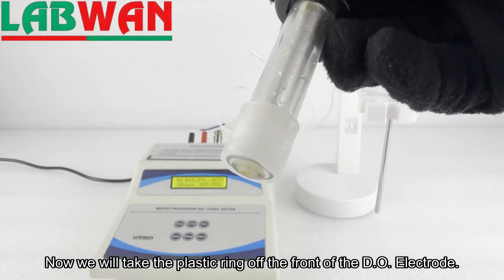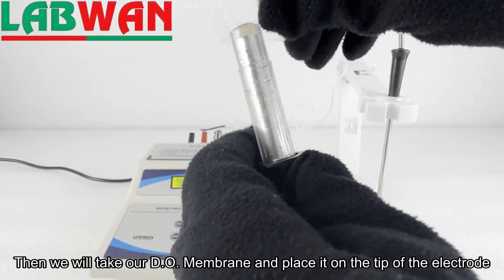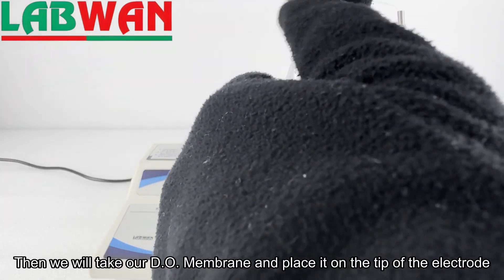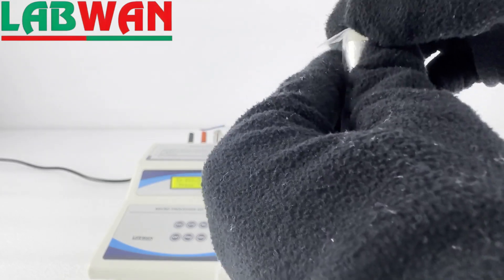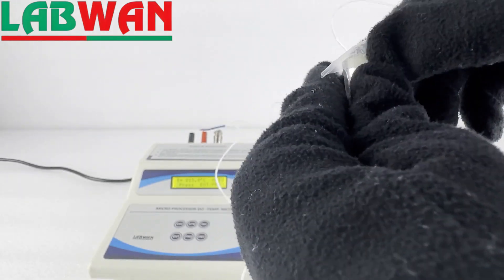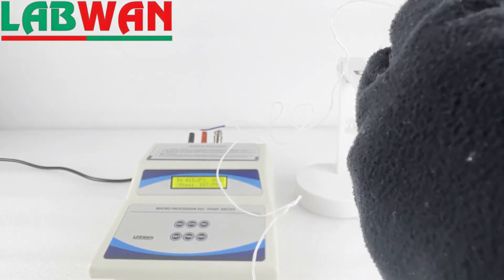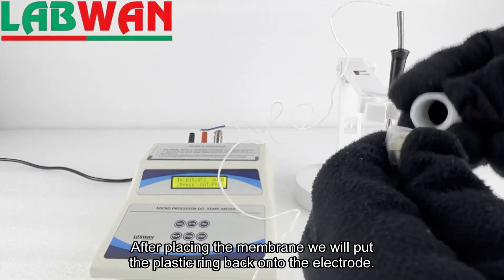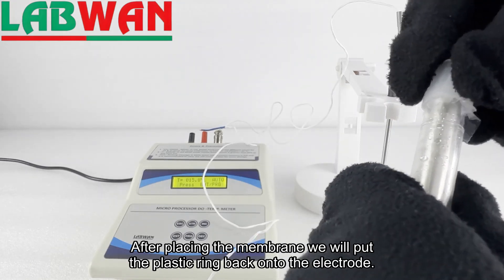Now we will take the plastic ring off the front of the DO electrode. Then we will take our DO membrane and place it on the tip of the electrode. After placing the membrane we will put the plastic ring back onto the electrode.